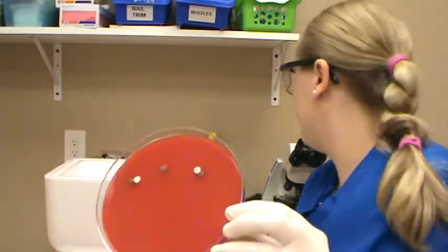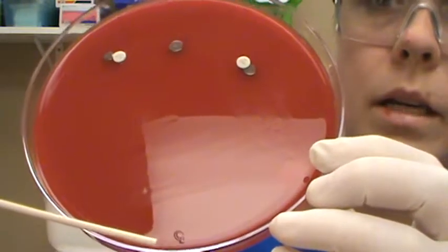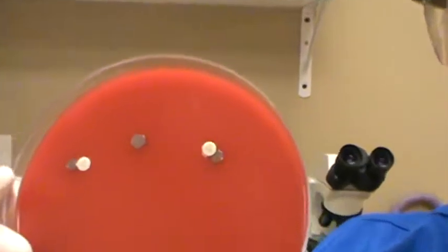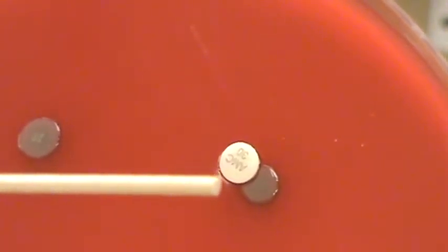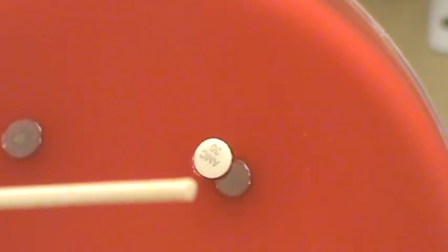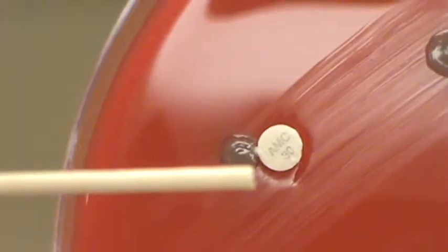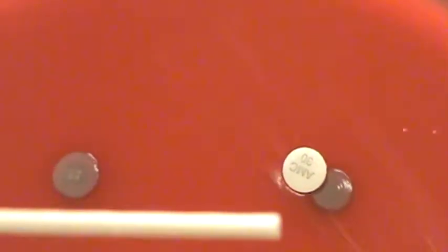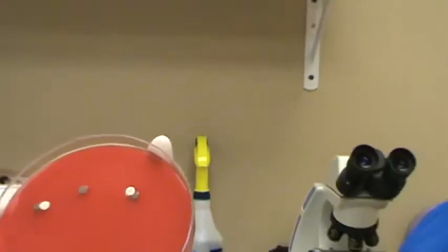The little green dots here show you. So here, here, and here. There's also a little spot down here that had some growth. Zooming in real close, we can see that the antibiotic disc, the Clavamox that I put here, is actually inhibiting the growth of that bacteria, whatever growth that is. It used to be completely round, and now the bacteria is being killed off by that Clavamox. It looks like it's working over here too, or starting to work over here, this little guy right there. We'll see if that gets better over the next 24 hours, but this one's definitely working. You can see the half moon that it's taken out of that bacterial growth. So this is definitely looking like it's sensitive to Clavamox.